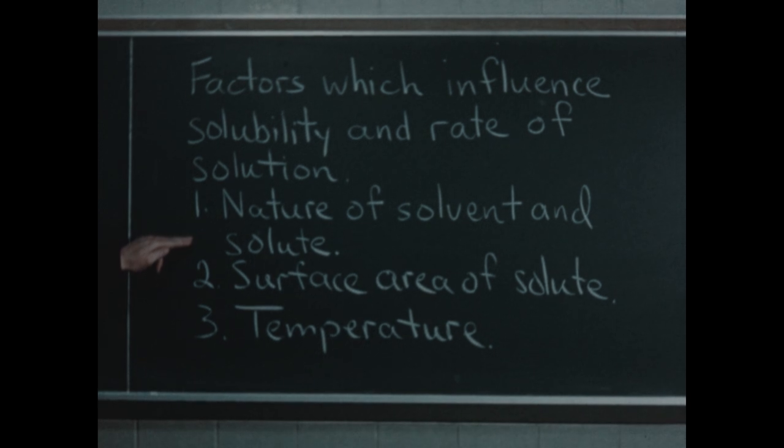We examined two rather insoluble solutes, calcium sulfate and calcium carbonate, and found that although they are each only slightly soluble, it's possible to differentiate between them, because calcium sulfate is more soluble than calcium carbonate. With respect to liquid-liquid mixtures, we found that water and glycerin dissolve in each other very nicely, that water and gasoline do not, but that gasoline and carbon tetrachloride dissolve nicely in each other.